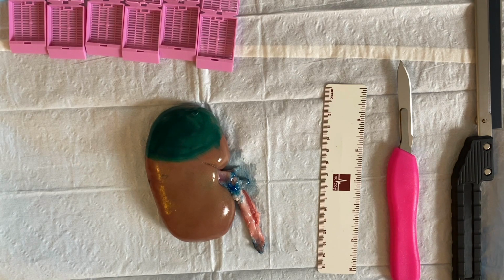I have additionally created an inked area on the superior aspect of the specimen. This is something that you would do after you palpate where a lesion is within the kidney. Remember that you should always check your radiographic images and the clinical history of the patient in order to identify where you should expect to find the lesion. But then you need to do the secondary work at the bench of palpating the lesion yourself.